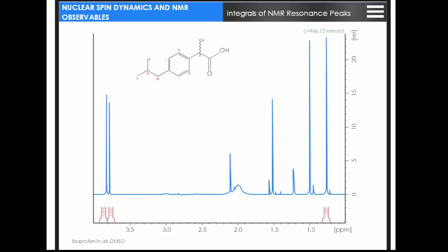Expansion to the full spectrum reveals 2 more resonances at 7.12 and 7.2 ppm, containing 2 protons each. These peaks can be assigned to the protons in the aromatic group. Thus, using exclusively integrals, all of the protons non-exchangeable with water can be unequivocally assigned, with the exception of the 2 possible assignments of the 2 single hydrogens in the isopropyl and propionate groups. The latter resonances can be unequivocally assigned using J-coupling multiplet patterns.